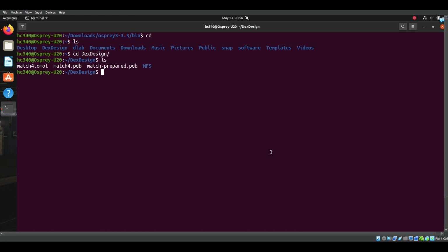We're going to look at the maximum contribution that a single residue can make to predicted binding affinity, and then we're also going to find the maximum flexible set for these point mutations. So let's walk through exactly how to do that. Before we jump into that, I'm going to do a little bit of organization.